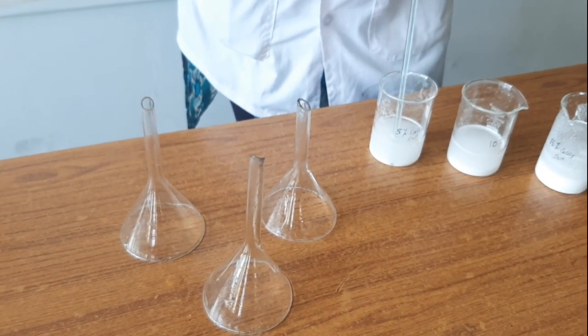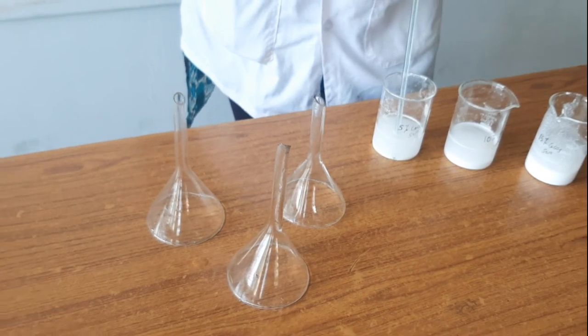Through the funnels of the same surface area, we are going to pour these different concentrations of the slurry, and we will check what time is required for the different concentrations of the slurry to completely get filtered. Now we will start with our experiment.